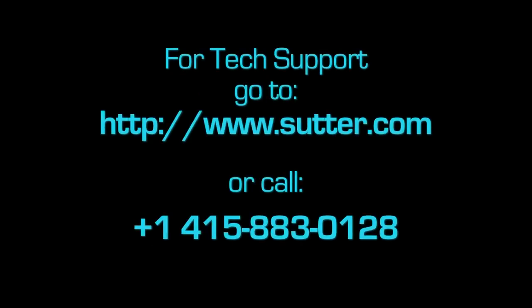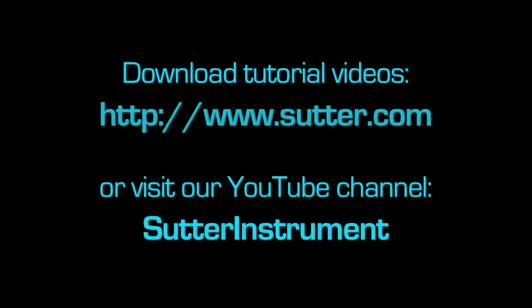This video is meant as a diagnostic tool. Please contact Sutter Tech Support for further guidance before making any adjustments or attempting repairs. Visit our website or our YouTube channel to watch the growing collection of Sutter tutorial videos.